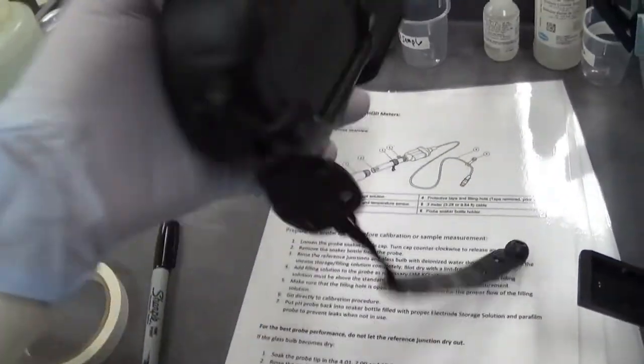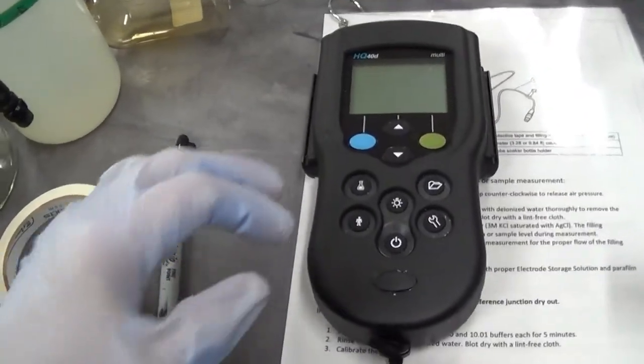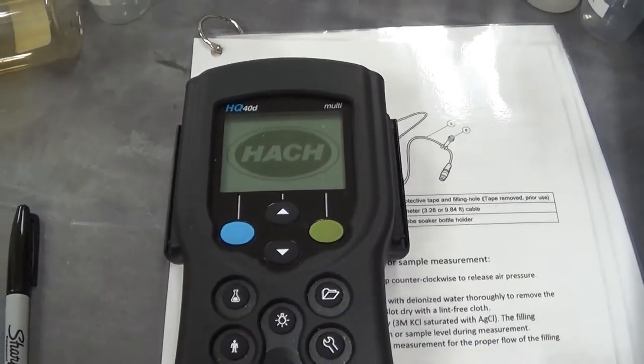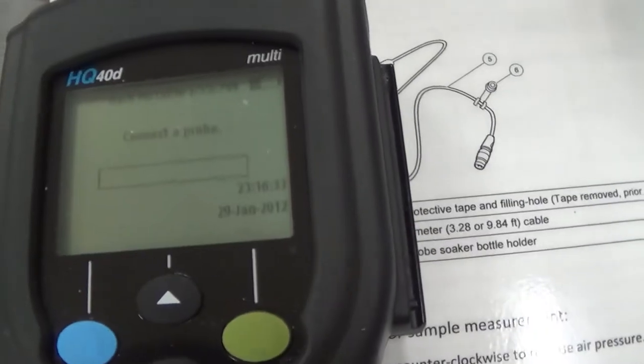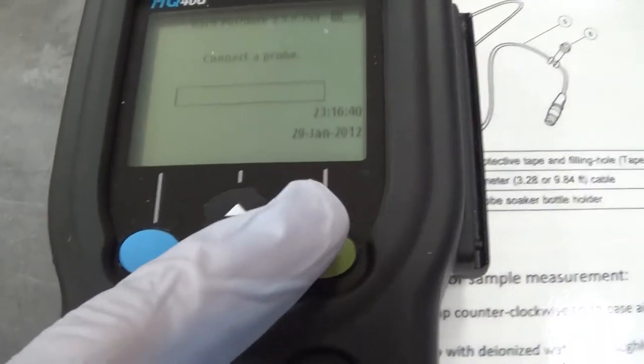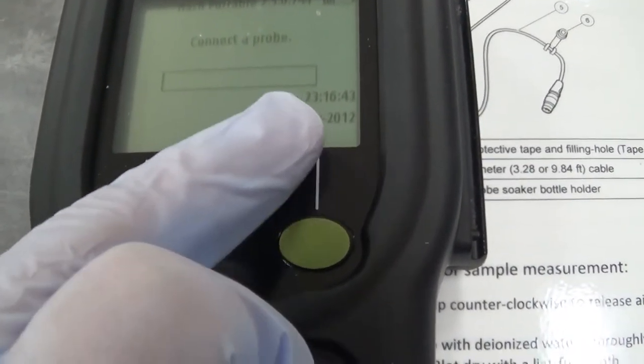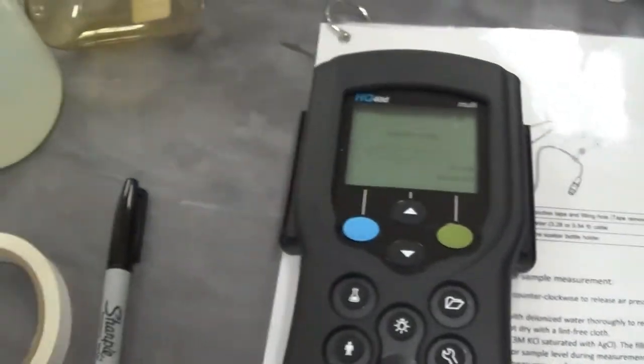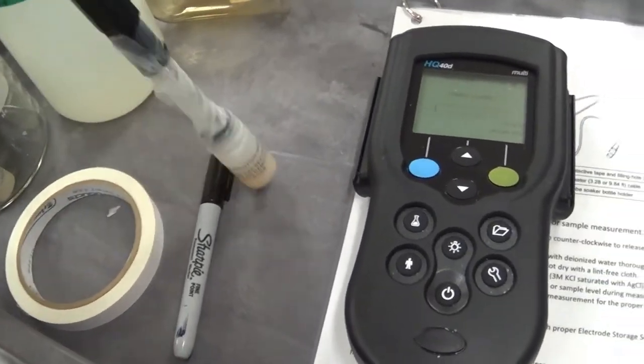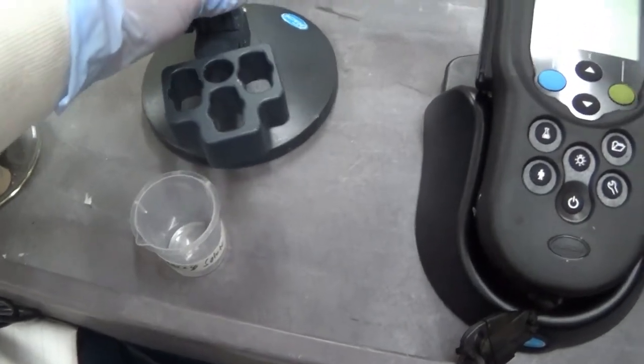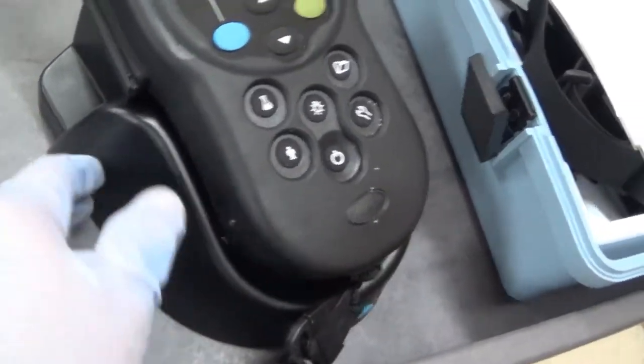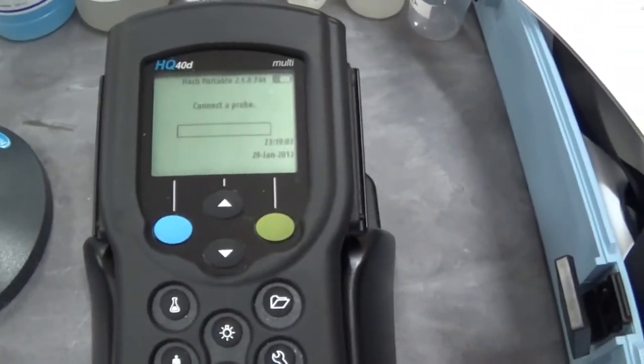We are going to get out our meter and turn it on. It says connect the probe. You see that the battery is at about one third right here. Of course, that's not our date. Let me grab a pH probe here. As I get ready, I found a stand that goes with the meter and then a little holder thing. Kind of helps you see the meter better.